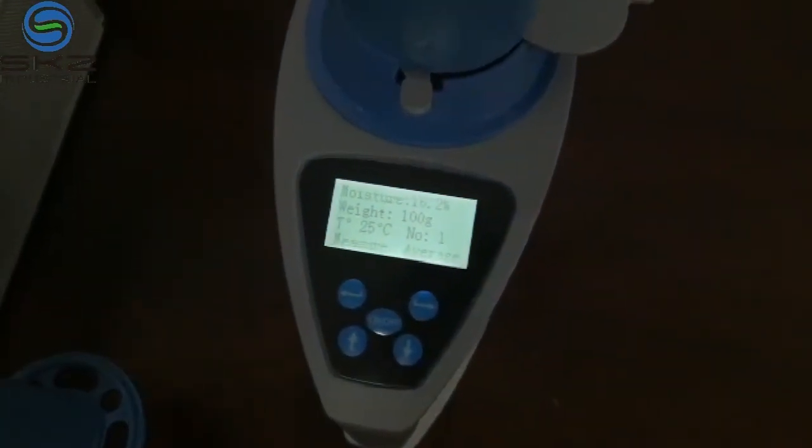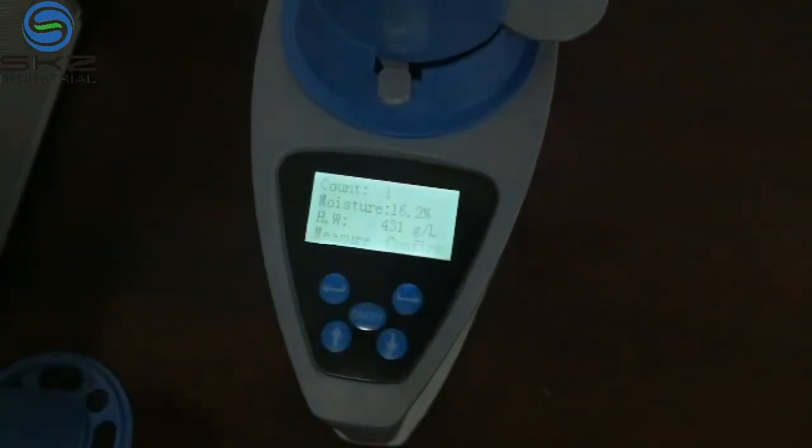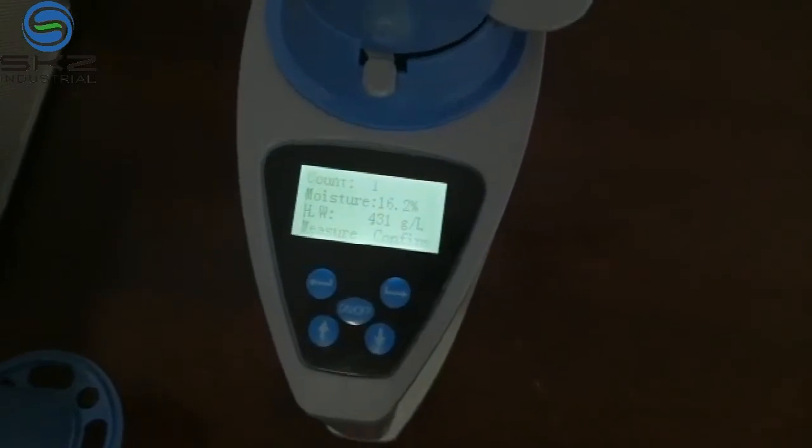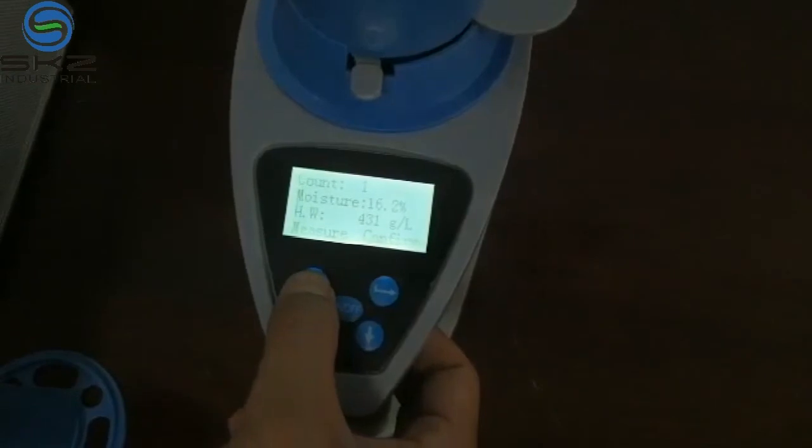For example, if you want to test several groups, you can press average. Then it will show the average and other information like individual weight. Thank you.